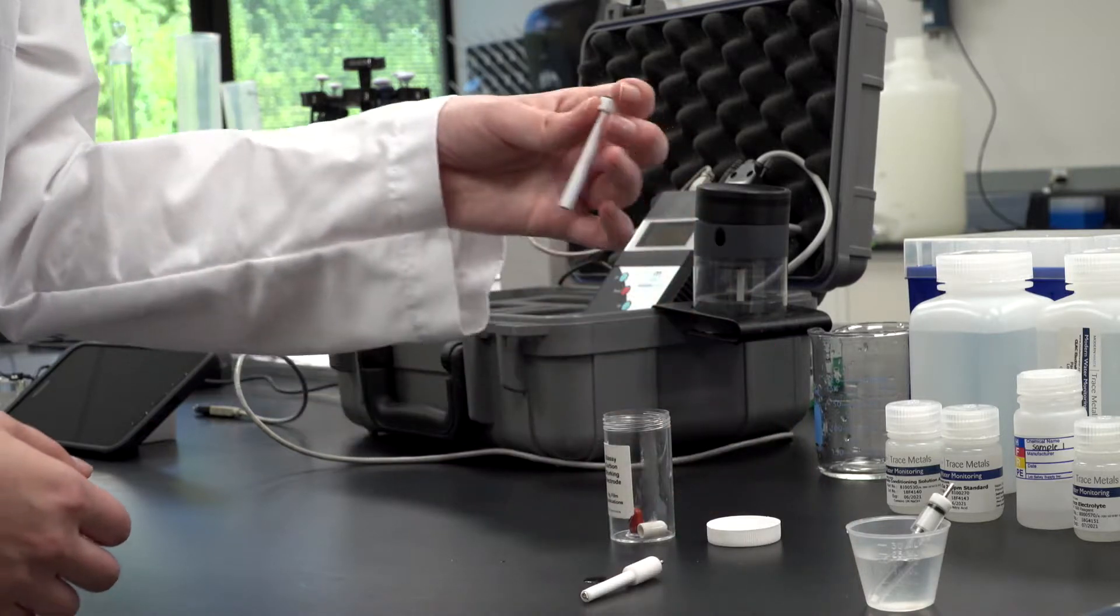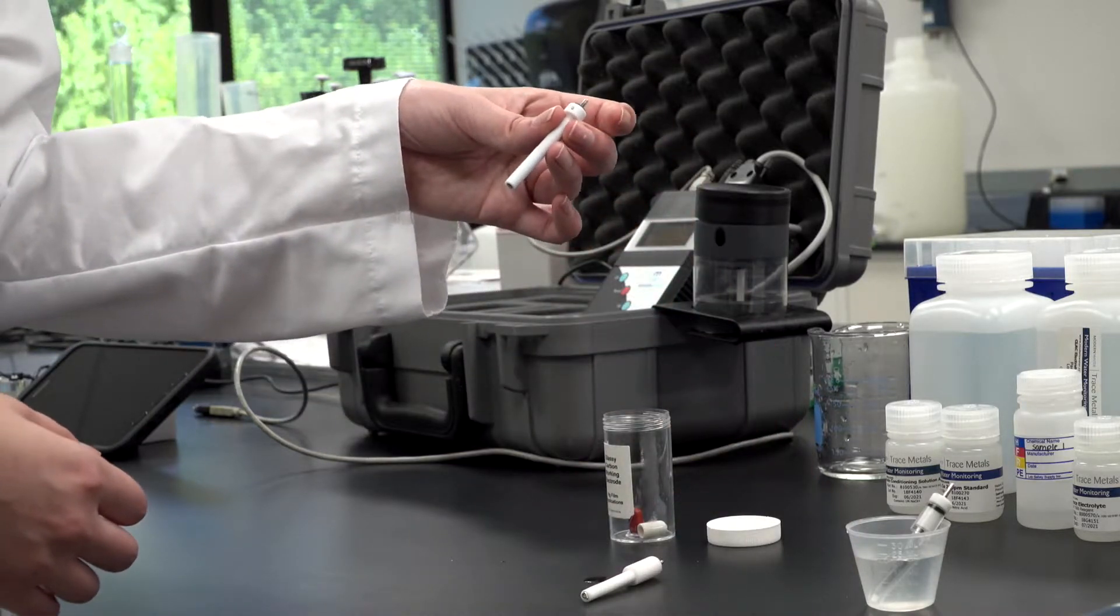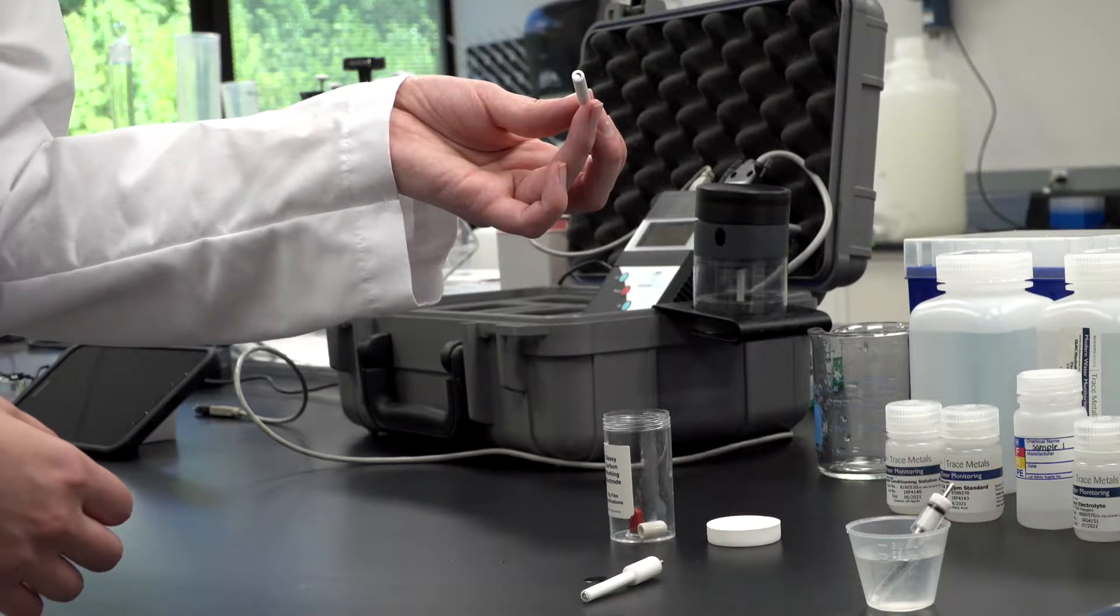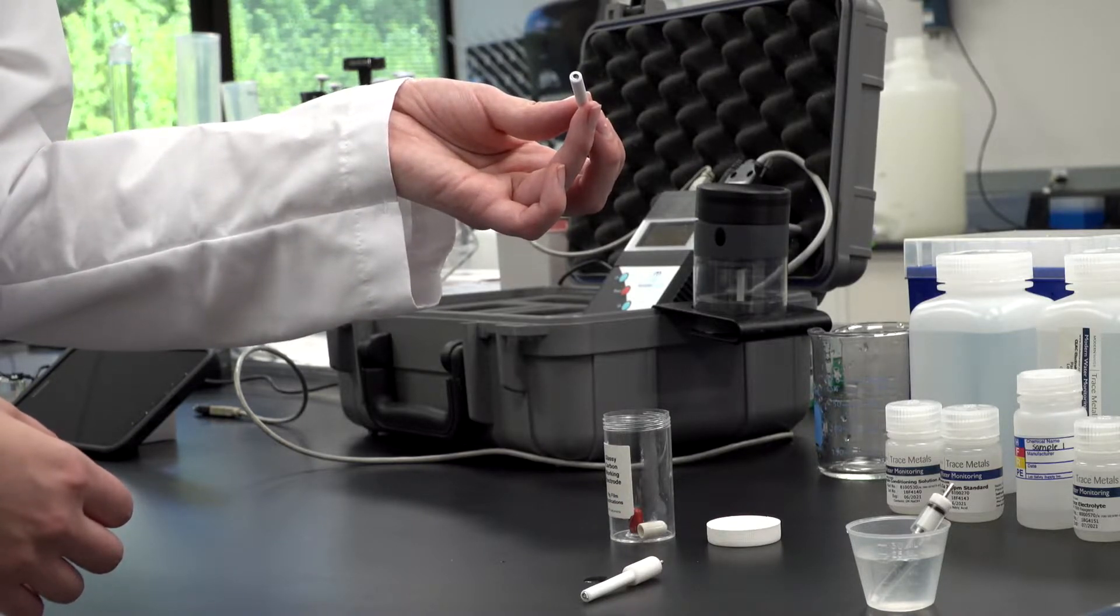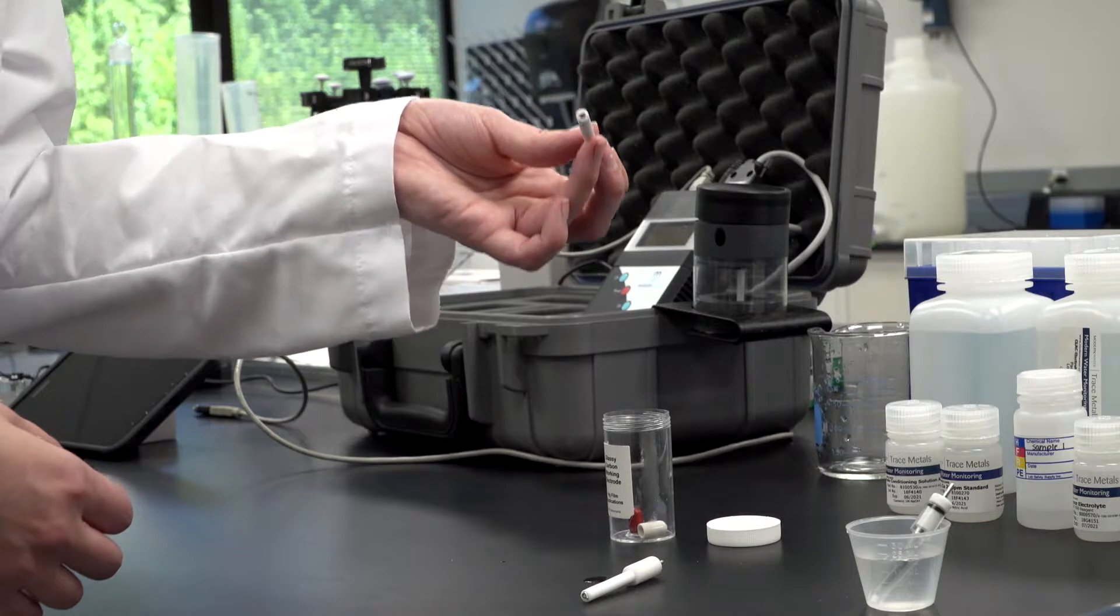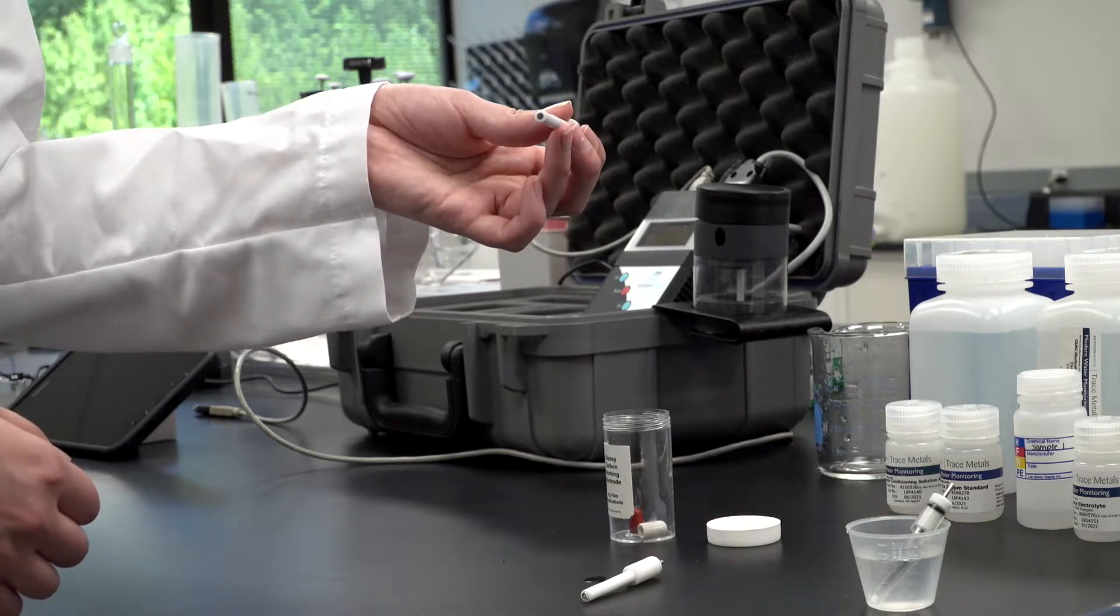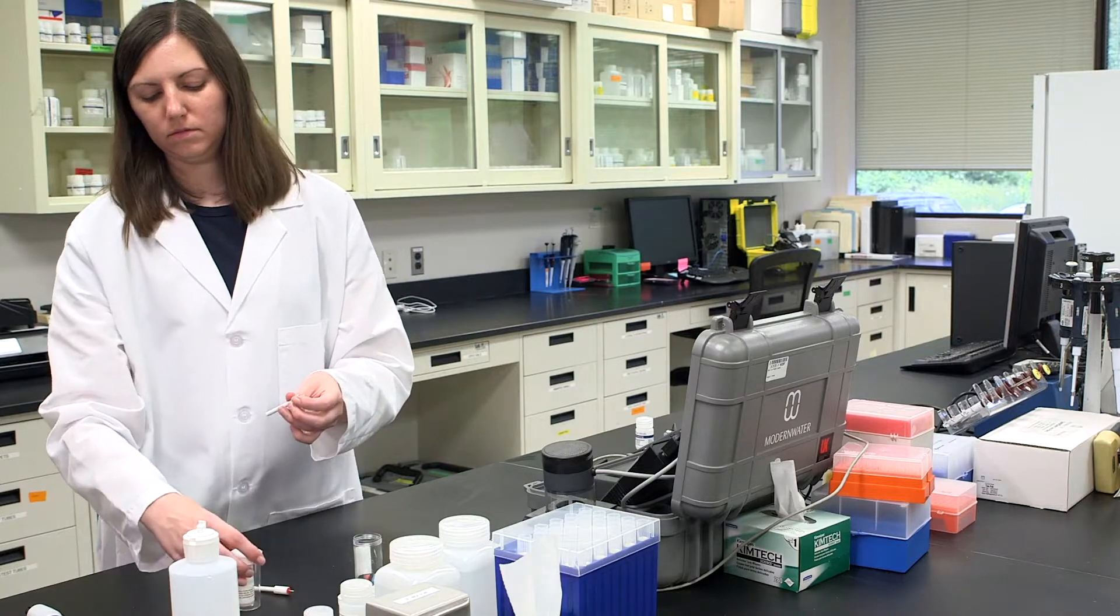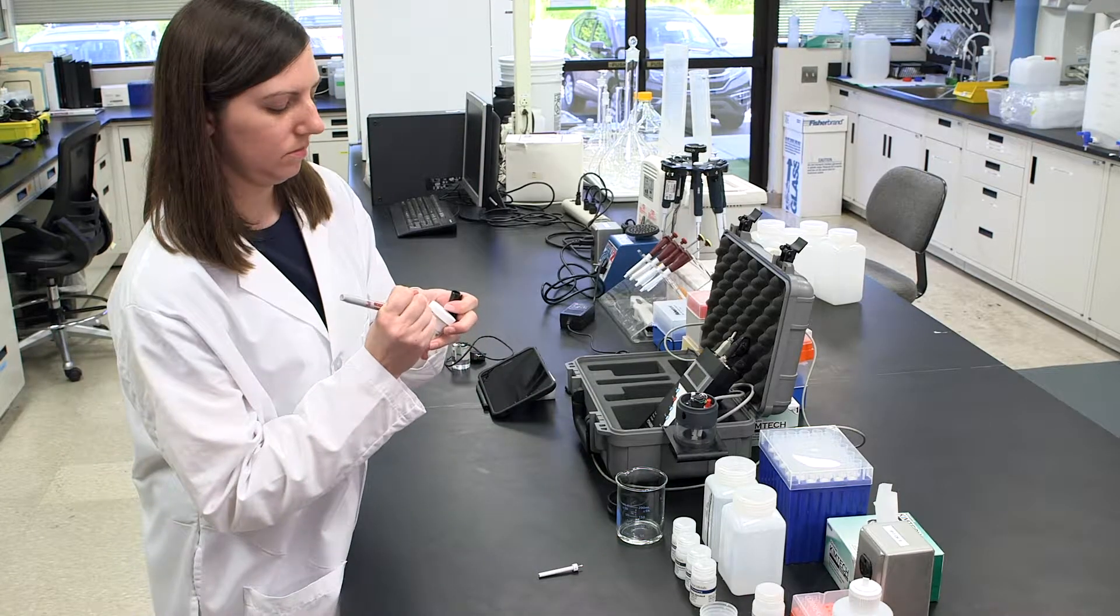The working electrode is where all the key reactions of the analysis take place, and its cleanliness is therefore critical. Do not touch or otherwise contaminate the working electrode surface, or you may need to repeat the following process from the start. To polish a working electrode, use a dedicated polishing kit, part number 190-023.